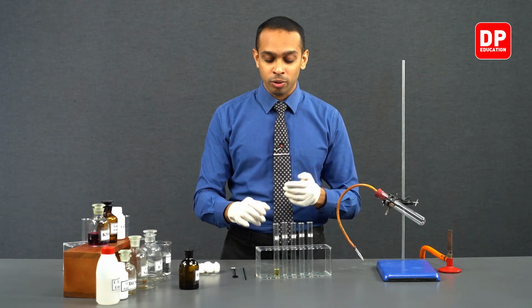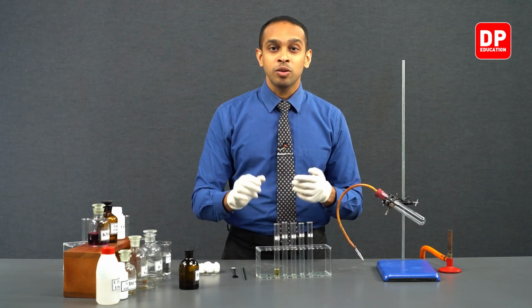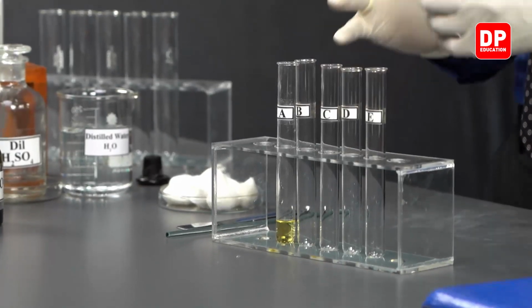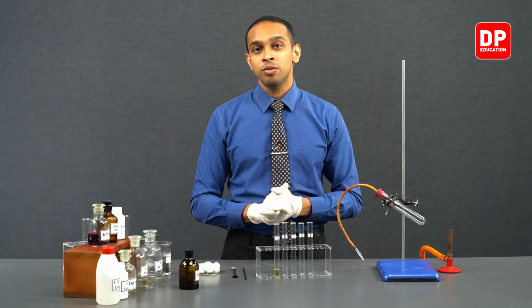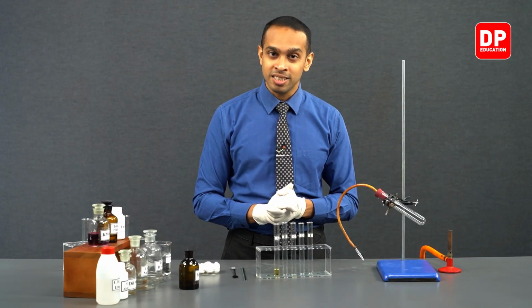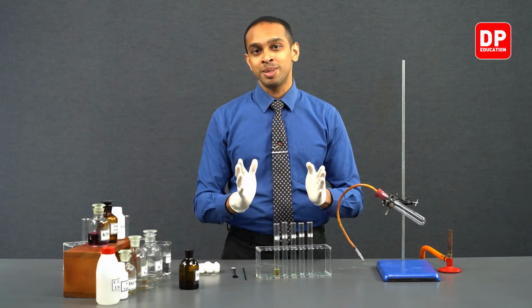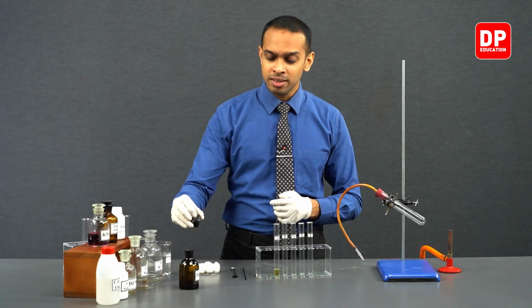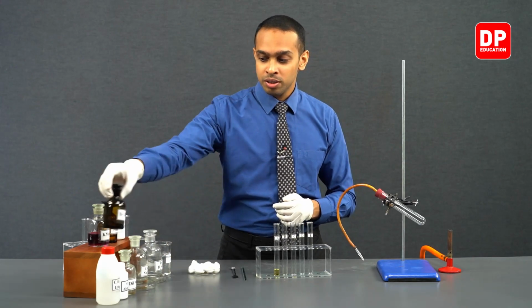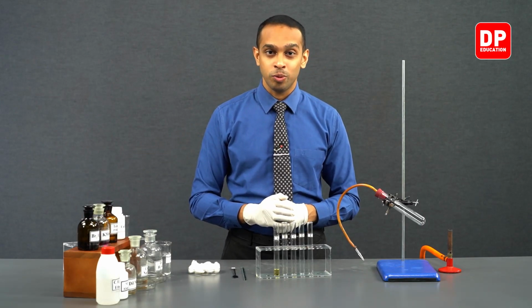Therefore, the bromine molecules found in bromine water will be used up, which will cause the color to disappear. Bromine water will turn colorless if an unsaturated hydrocarbon reacts with it. Keeping that in mind, you should observe that in test tube A, we have bromine water.